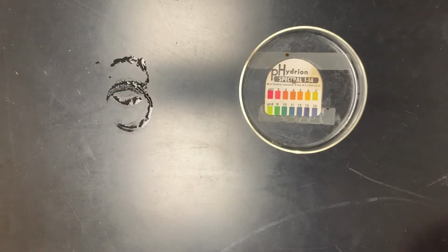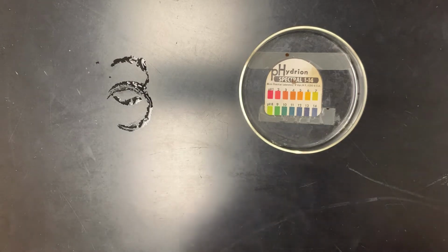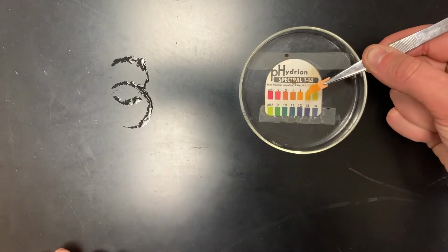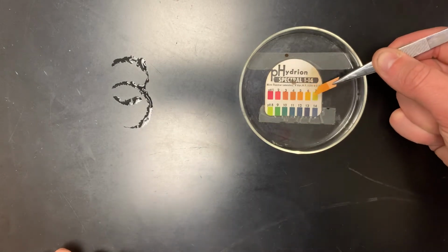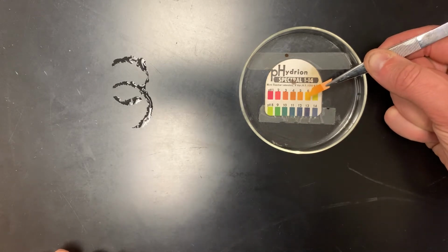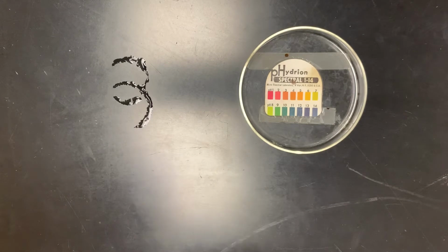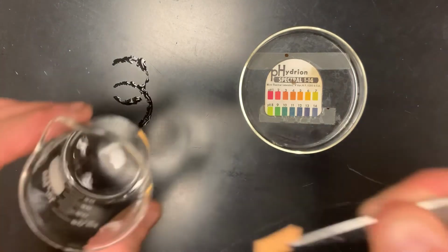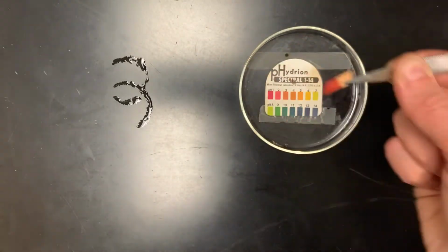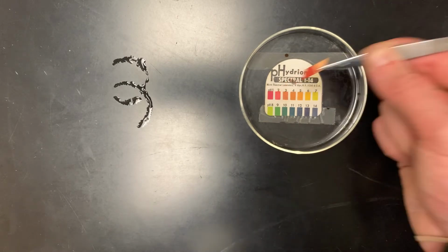So the first solution we're going to take a look at is that of ammonium oxalate. So I have ammonium oxalate here in the beaker. We'll take a look. I'd argue about a 6 to 7 there, okay? Next up, we have aluminum chloride. So again, the goal is really to figure out, based on the data, is it the aluminum or is it perhaps the chloride that's really causing this dramatic shift in pH? We find this is quite acidic, maybe ringing in at about a pH of 2.